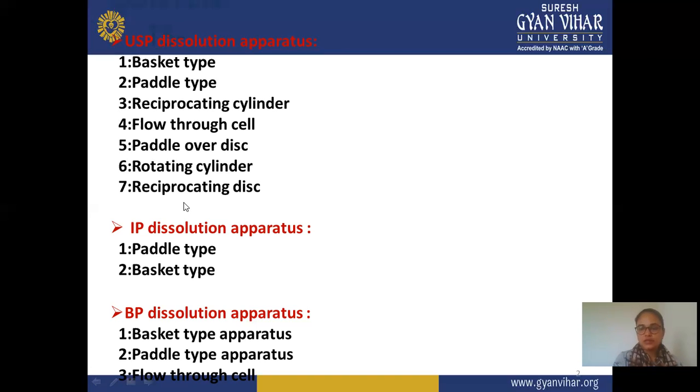These apparatus have different construction or different working conditions, and their rotation may also vary. A particular apparatus is used for a particular formulation, meaning every apparatus suits a different formulation for the dissolution test. And we discuss these apparatus one by one in the next slides.